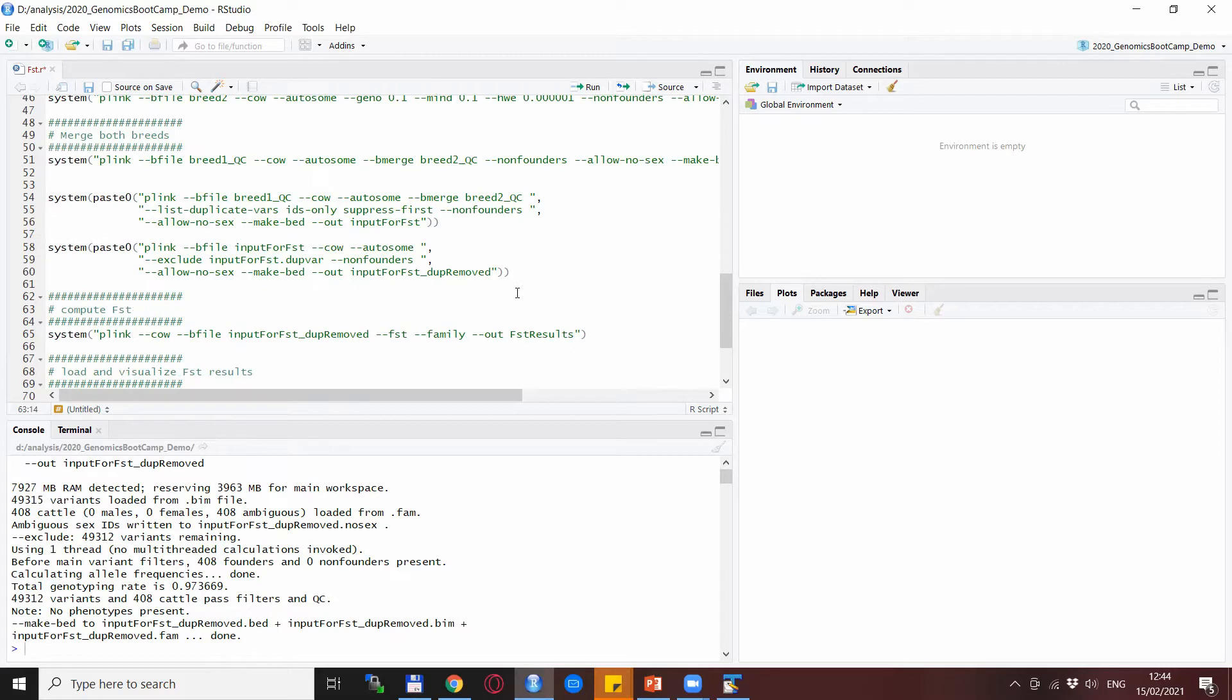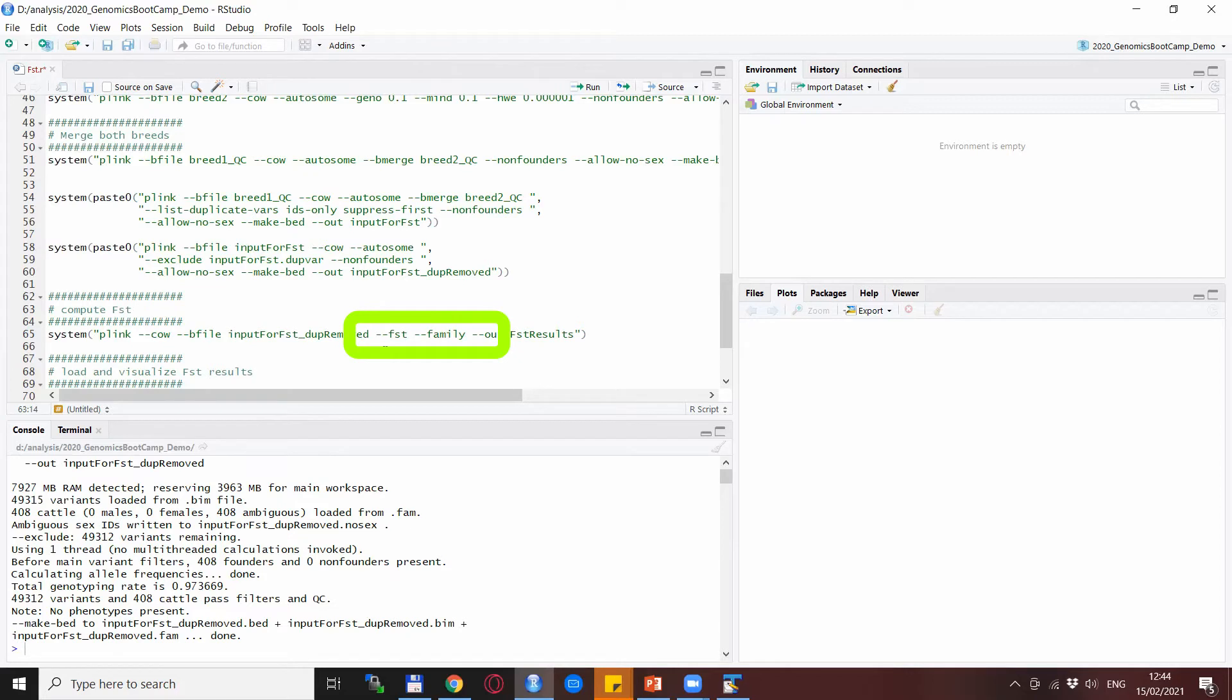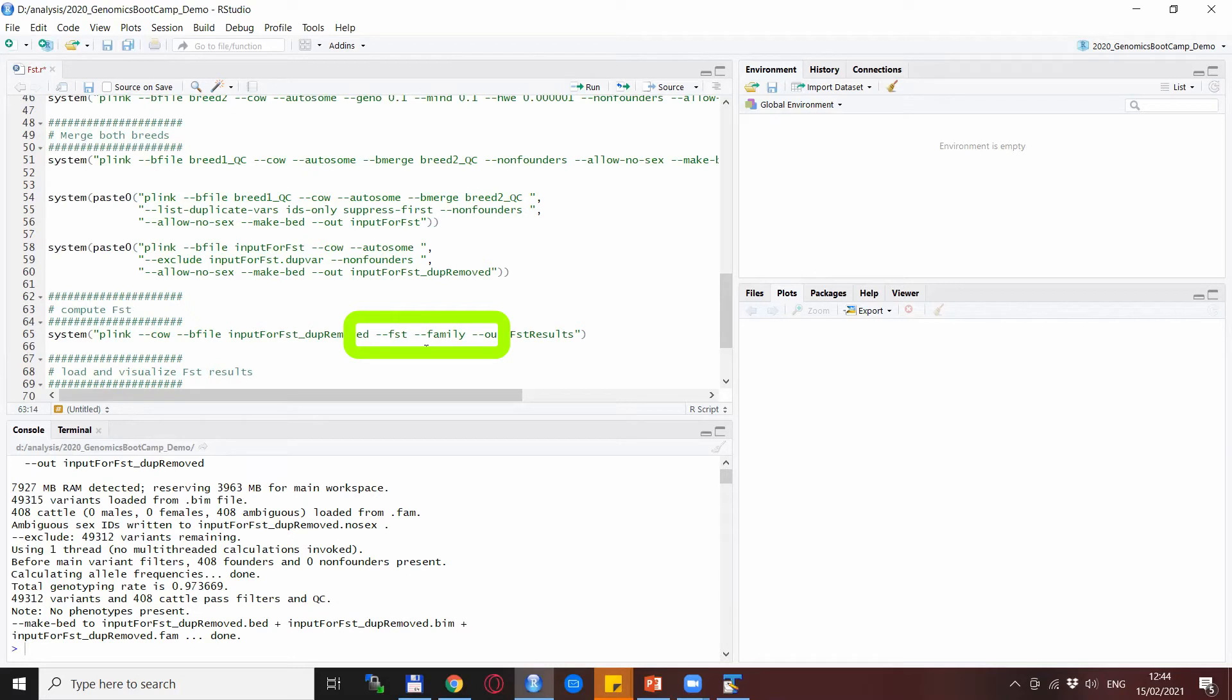The next thing to do is the actual FST computation with the now input for FST duplication removed data set, and with the --fst statement or option with Plink. Also, because we have a very neatly organized file with the two breeds, we can use the --family option. So basically it compares the two breeds together and gives us the results—the FST between the two breeds for each SNP.